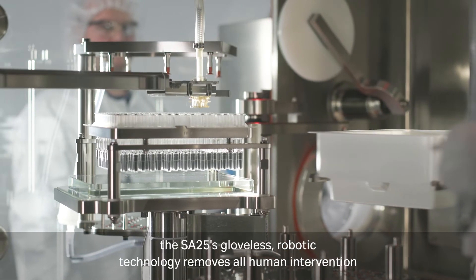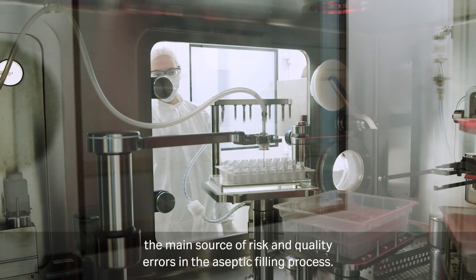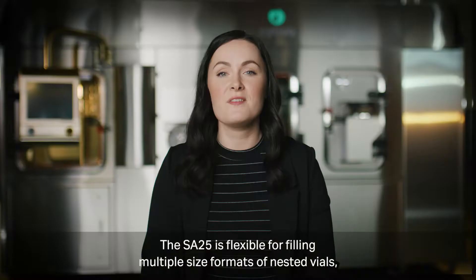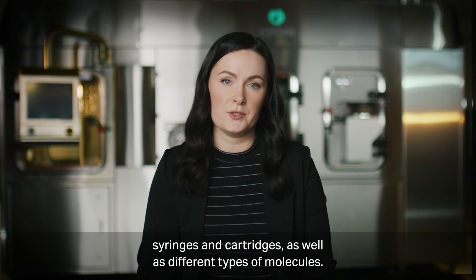Once the operation is built, the SA25's gloveless robotic technology removes all human intervention — the main source of risk and quality errors in the aseptic filling process. The SA25 is flexible for filling multiple size formats of nested vials, syringes and cartridges, as well as different types of molecules.